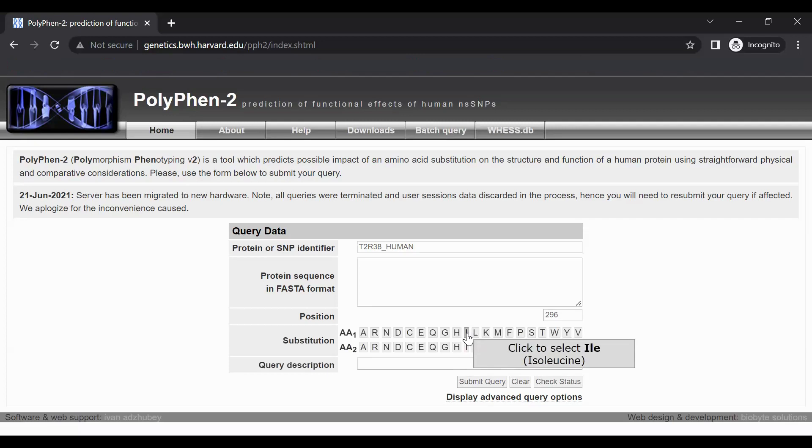The AA2 row represents the substitution amino acid. So for this TASTER variant, select V for valine in the AA2 row.